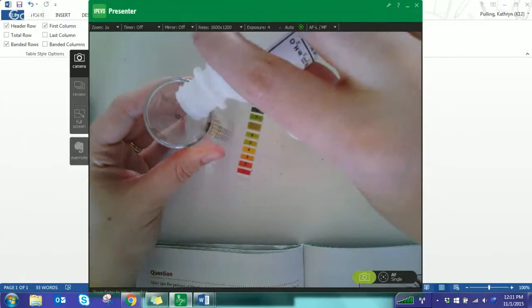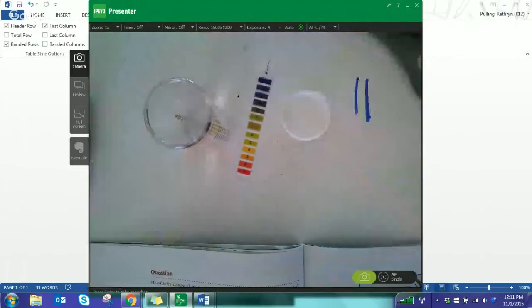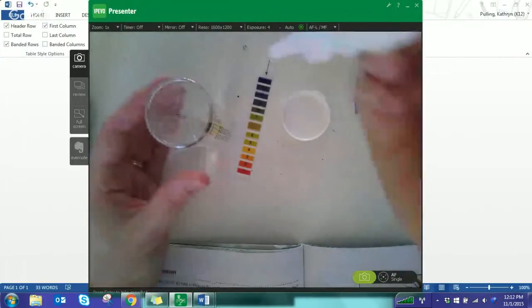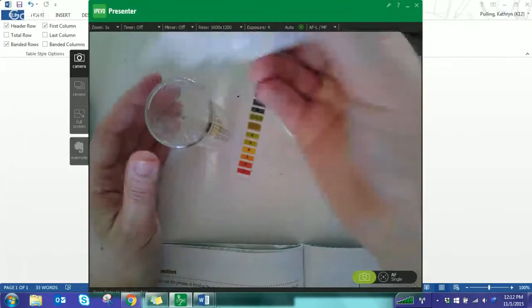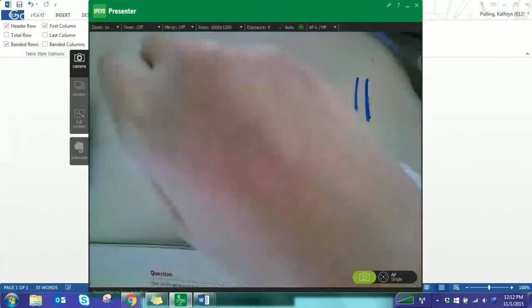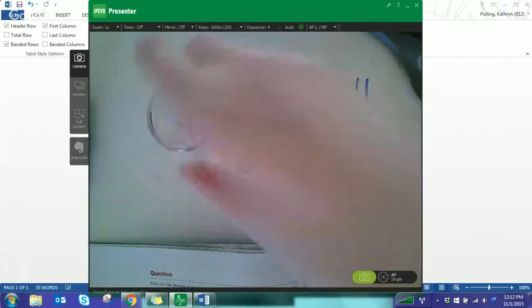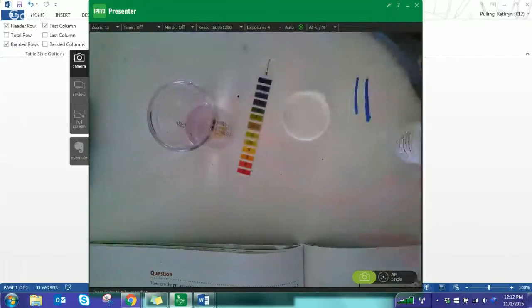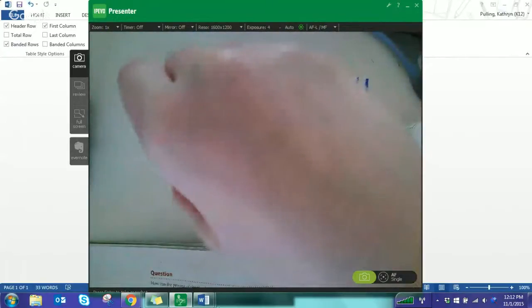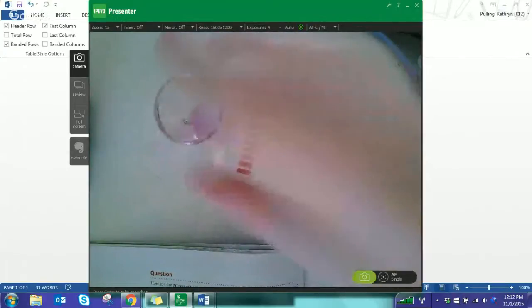This is something you may run into having to do too while you're working. Okay. Yeah, because actually color-wise, I'd say my pH shift looks like maybe it's more around 5. So phenolphthalein indicator, putting in 3 drops again, which still is not giving me much pink color. This isn't affecting your pH at all. It just reacts with, it can tell that the base is in there and therefore changes color.